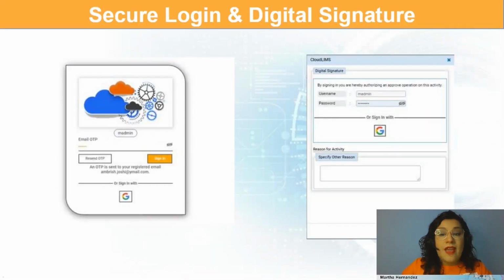For example, a LIMS enforces the staff to authenticate themselves using two-factor authentication mechanisms. It's an OTP and a password-based login for this secured data access. So the two-factor authentication is required when LIMS information is accessed through different devices, including phones or laptops. It adds an additional layer of security to confirm that the first layer of security, the login passwords, has not been compromised. Moreover, it locks the staff accounts temporarily on account of multiple failed login attempts.